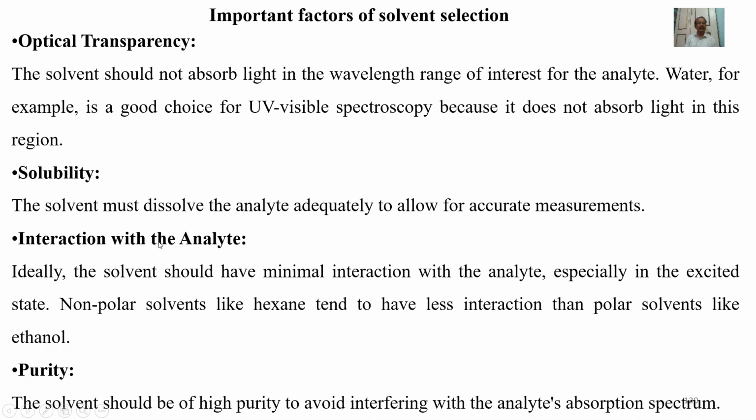Interaction with the analyte. Ideally, the solvent should have minimal interaction with the analyte, especially in the excited state. Non-polar solvents like hexane tend to have less interaction than polar solvents like ethanol. Purity. The solvent should be of high purity to avoid interfering with the analyte's absorption spectrum.